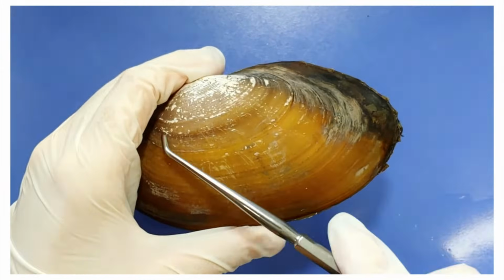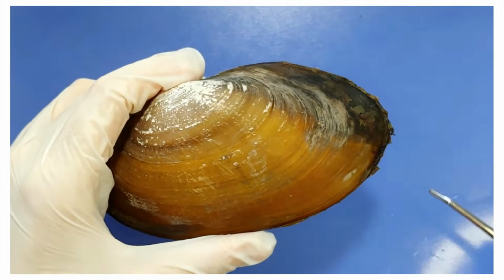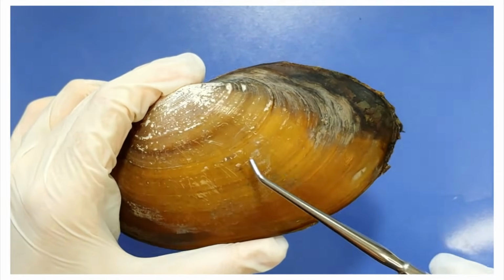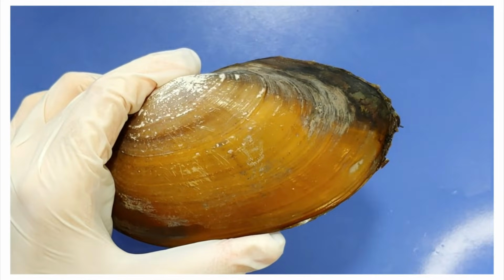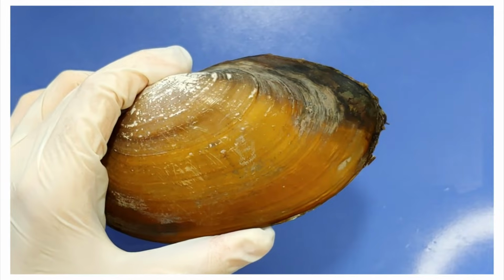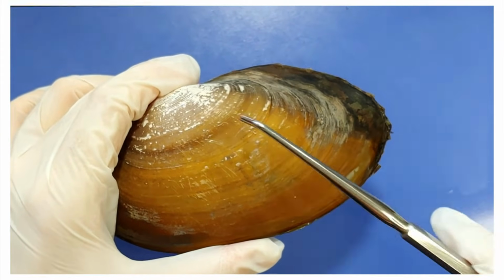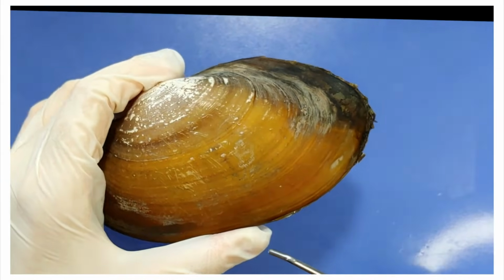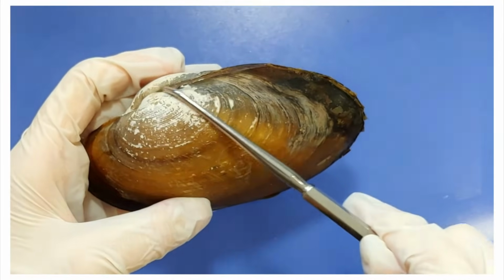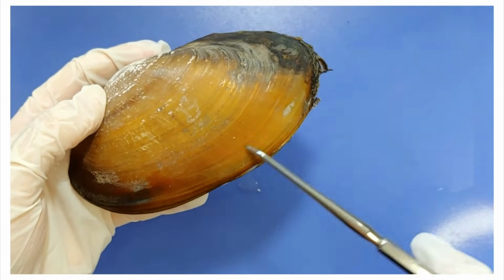The clam also has rings, kind of like a tree. These rings can tell you that the clam is old. We humans have to look at things like gray hair or wrinkles, but for clams, just count the rings. The part closest to the hinge here would be the oldest part of the clam, and the part further away would be the newest.